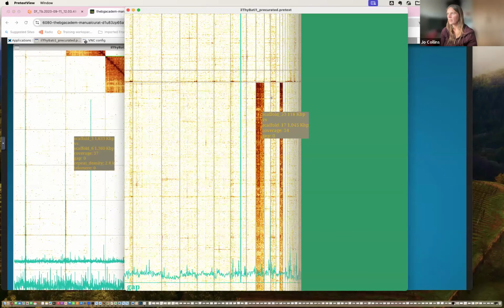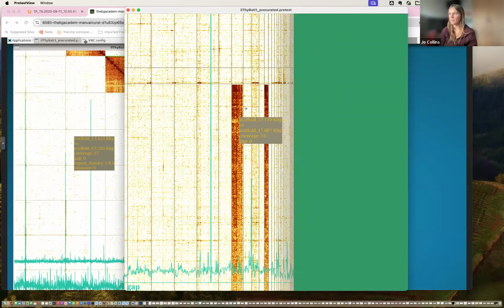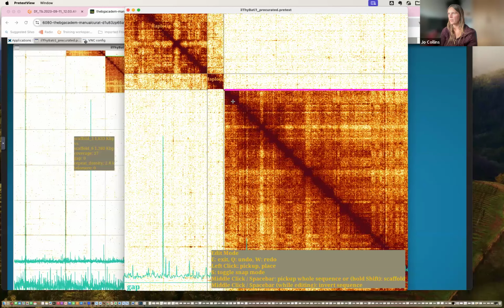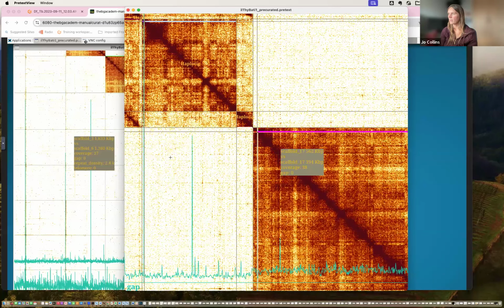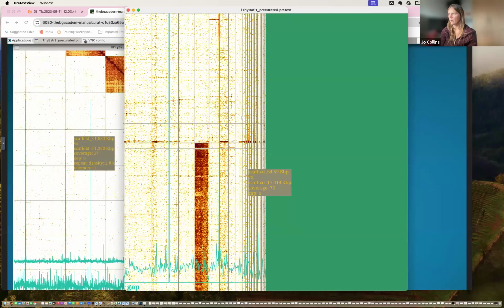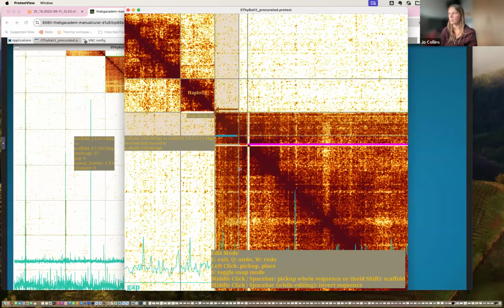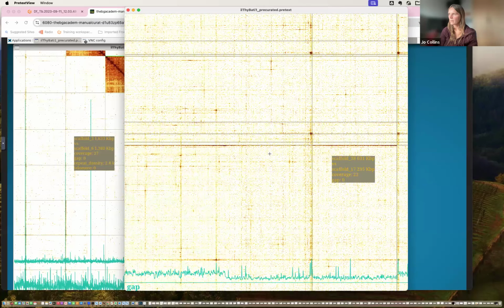So again, I think I'm going to take this piece first because I can see this piece as part of my chromosome, but I think I need this piece first because that has the strongest match. So I put it to the right end, and I flip it to make sure I've got the strongest match there. I might have something on the end that doesn't belong there, maybe. And then I go back. And now I've got the strong contact with the end piece. So I had to put one piece there and then it gave me the ability to see what I needed to put next.